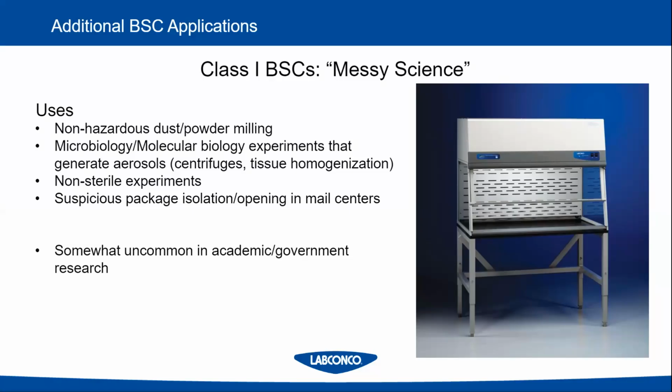So you have a centrifuge on the inside, you're homogenizing tissue, anything that's messy and that you want to be contained, but you don't care about sterility. Because remember, all the air that's drawn into the class 1 biosafety cabinet comes directly from the lab without being filtered.